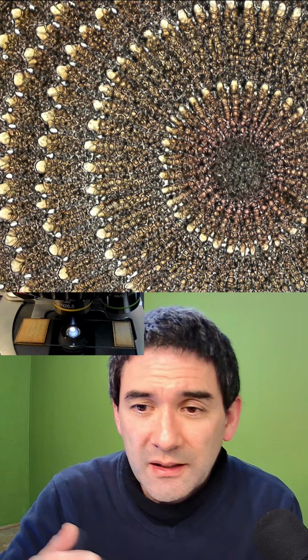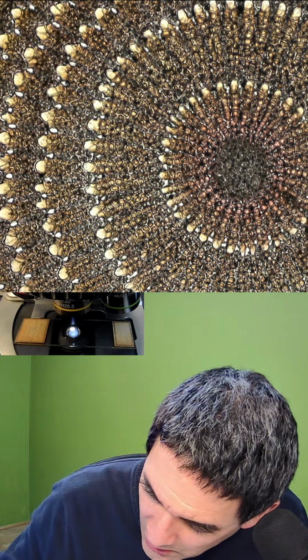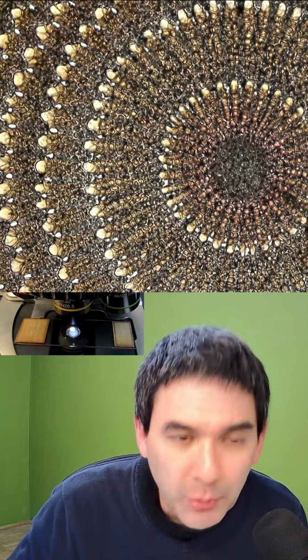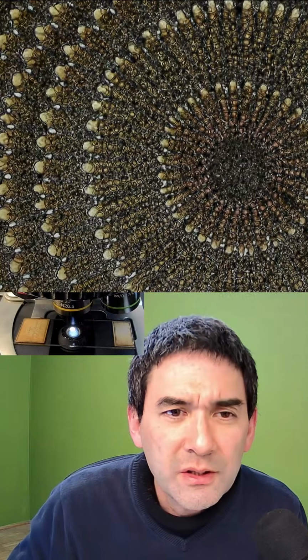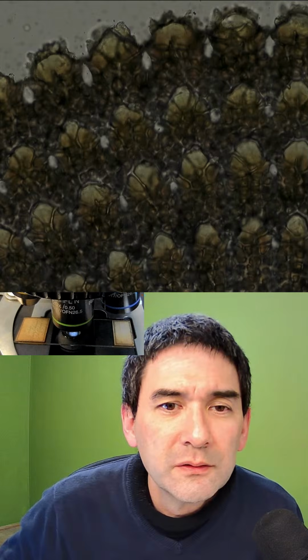So that's polarization. Right now it's not polarized, because I pulled out the polarization filter, and also the prism. So right now it's just regular bright field. So we go up a little bit here.